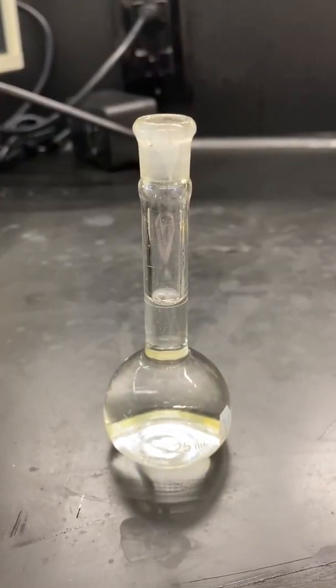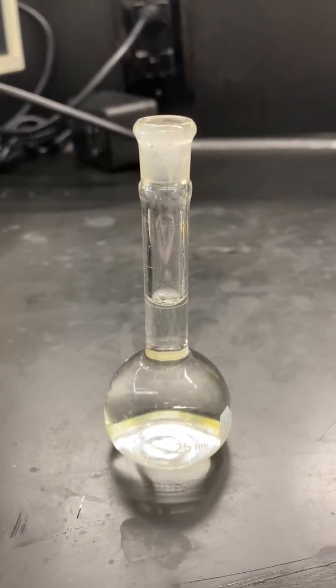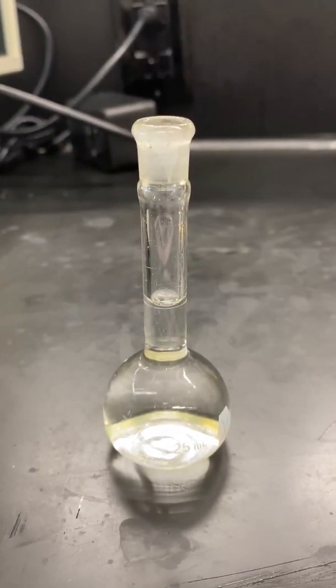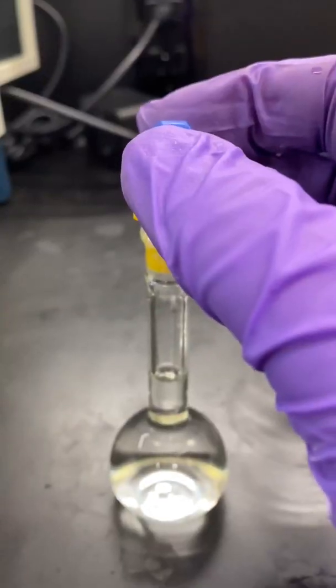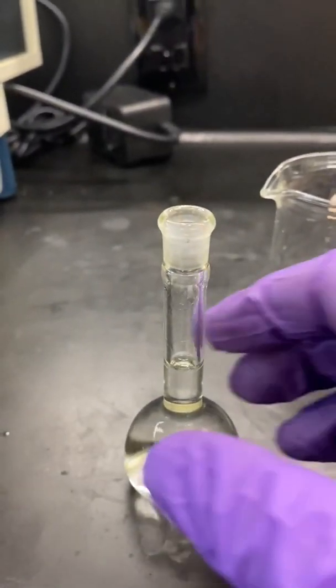Fill the 25-milliliter volumetric flask to the mark using distilled water. Then cap it and invert several times to make sure it's evenly mixed. This solution is referred to as Stock 1.